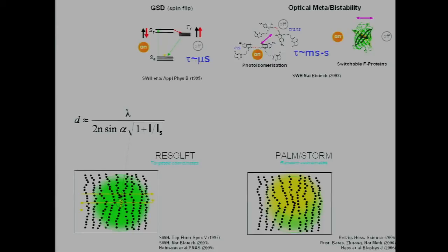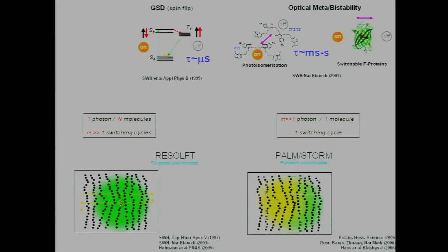So is this useful? The answer is yes. Because with the fluorophores emitting, say, many photons from the same place once it's switched to the on state, you can project it onto a camera. And then you can locate each position and find out where it happens. So you switch it on, switch it off, go to the next, and then you assemble, so to speak, mathematically the whole image. Again, all the molecules are flooded with excitation light, but only this one is allowed to emit. Like here, all flooded with excitation light, but only here is allowed to emit. So this on-off makes a separation.